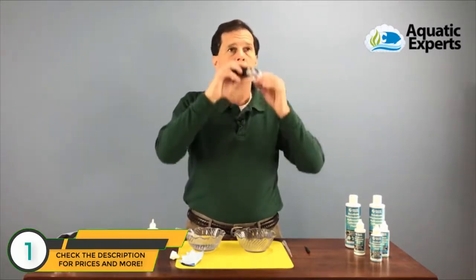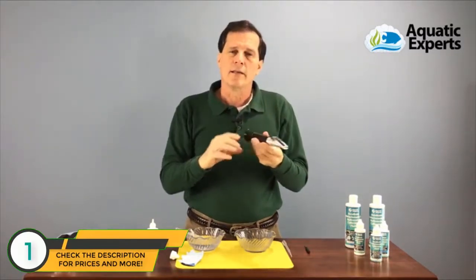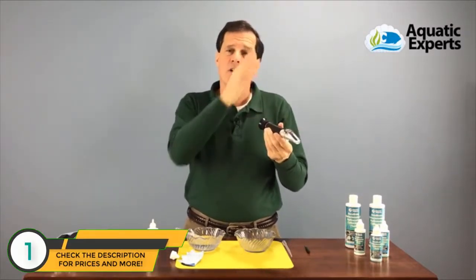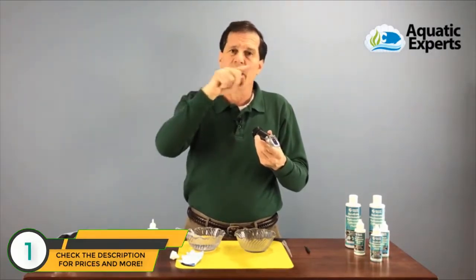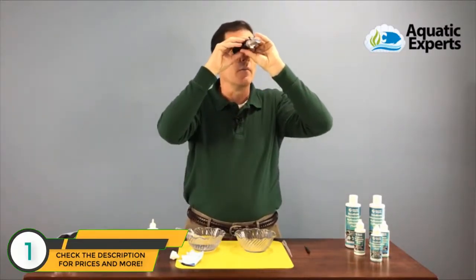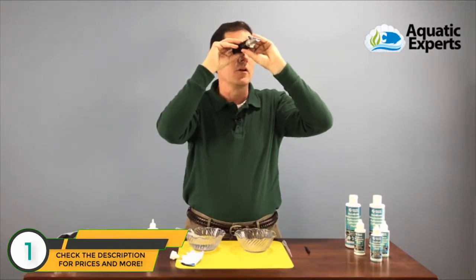Now I'm going to look into the refractometer toward the light and read the scale inside. The left-hand side of the scale shows specific gravity, and the right-hand side shows salinity. When salt solution is present, a blue line comes down from the top, and I read the edge of that blue line on the scale. Adjusting my eyepiece, I'm currently reading about 34 parts per thousand on salinity, so I need to move it up just a little bit.